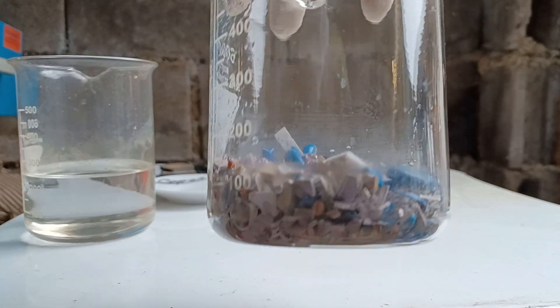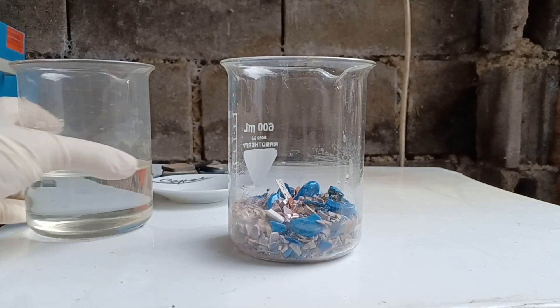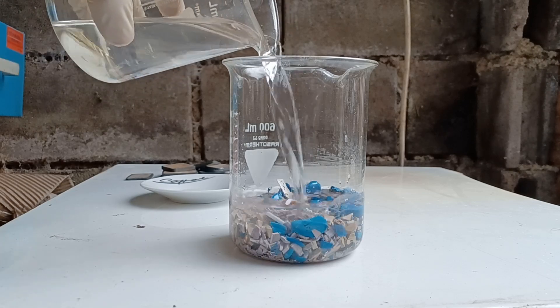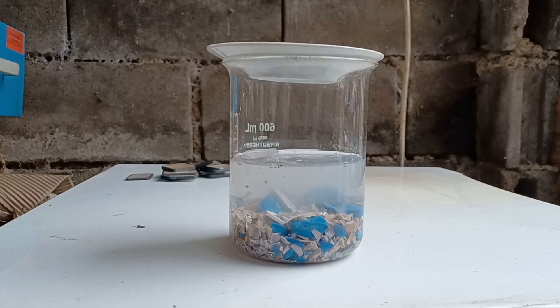I started with 350 grams of crushed ceramic capacitors. To them I added 250 ml of 10% nitric acid. Nitric acid will dissolve silver and other metals and turn them into soluble nitrates. The reaction will also produce nitrogen oxides.